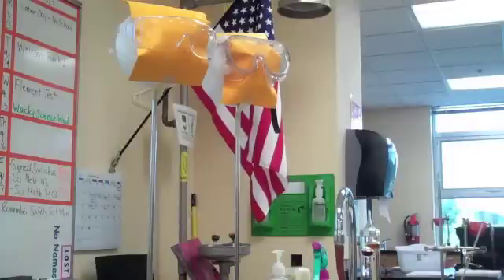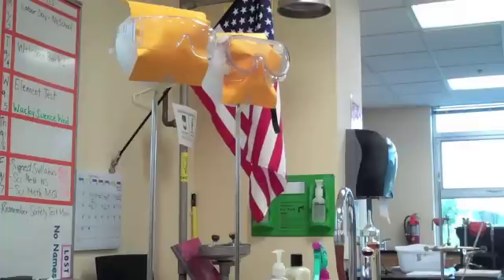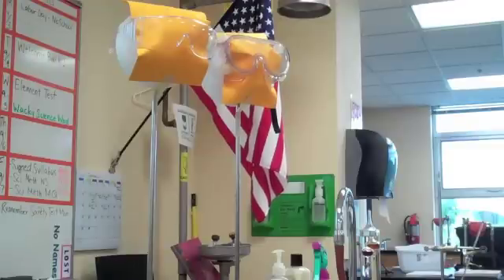We've got two types of goggles here. The ones on the right are the kinds that are Minnesota State approved — those are the ones you will be using in the lab. The ones on the left, I picked up at Gander Mountain in the hunting area, because people can try to make sure that they don't get shrapnel with their goggles. That's what's on the left.